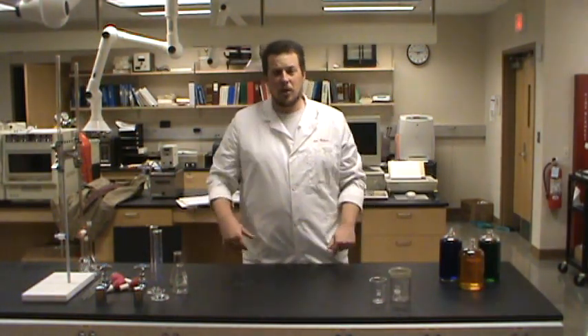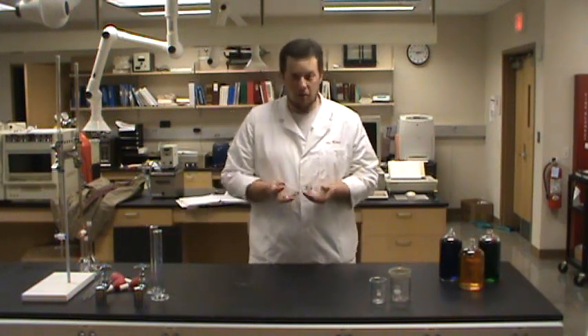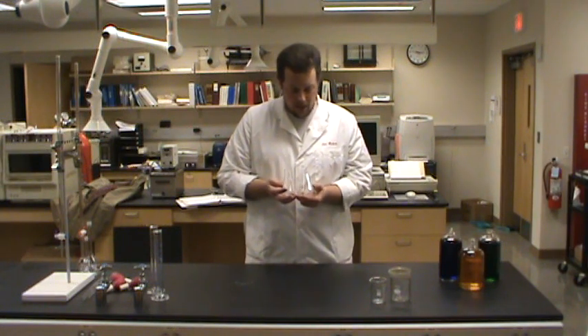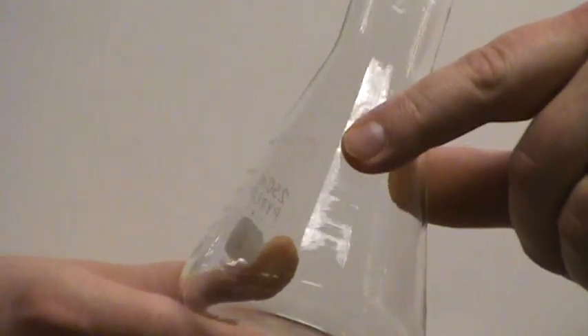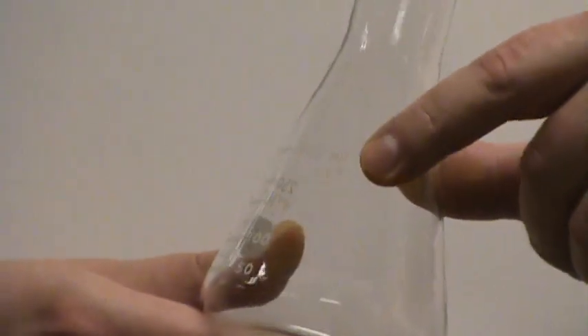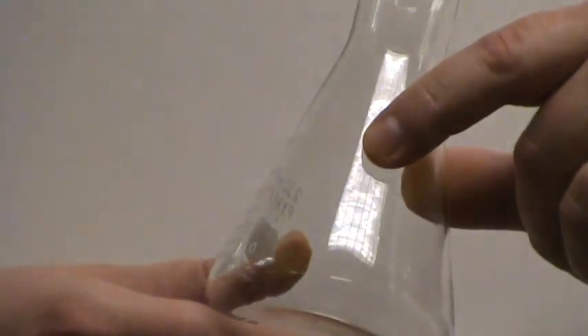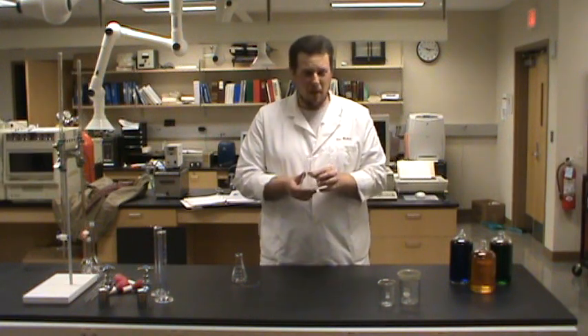Another piece of glassware that you've got in your drawers that you may have used so far are Erlenmeyer flasks. I've got a couple of Erlenmeyer flasks here. And again, if we look very closely at the label, we can see that it says right on the label that this is only good for plus or minus 5% on the volume measurement. So with that 5% error, Erlenmeyer flasks aren't good at very accurately measuring volumes.